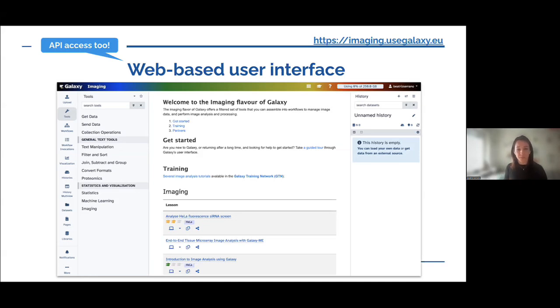So this is important because it's still the same infrastructure as the European Galaxy server. That's where we are doing this. So the URL is imaging.usegalaxy.eu. It is the same computational resources, the same quota, the same memory that you have available. You have the same resources behind. It's just that the front end has a tools filter, because in this app store there are now like 10,000 tools. There's no point in having all of them there. So we just filter and keep the ones that are relevant for the imaging community. So that's why you will see this.